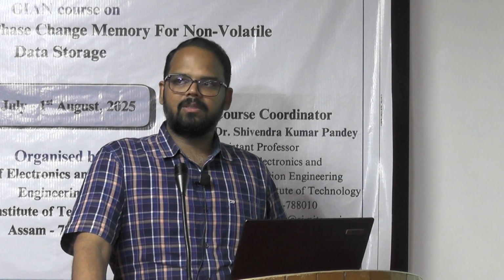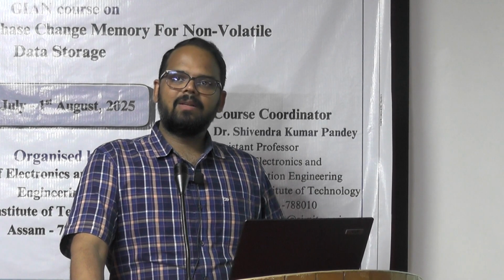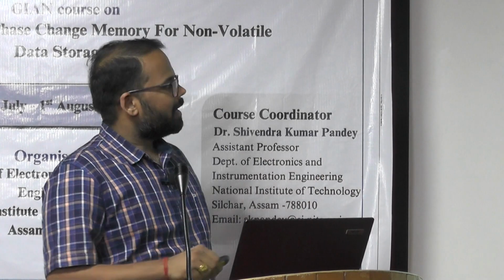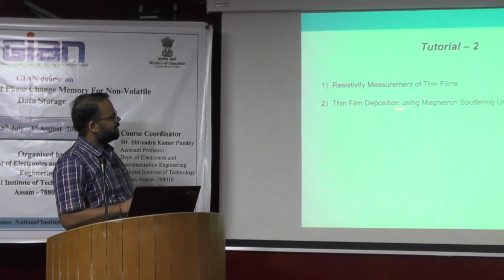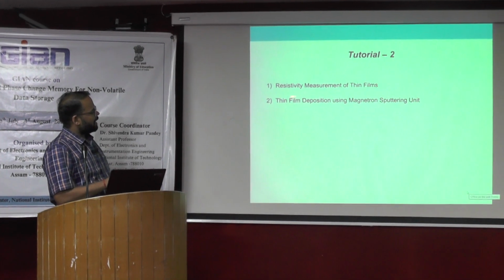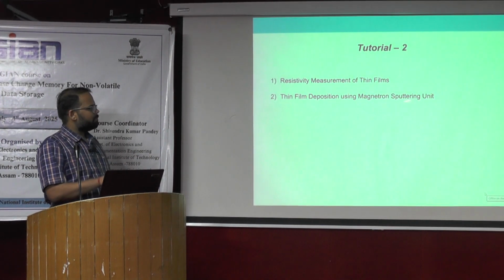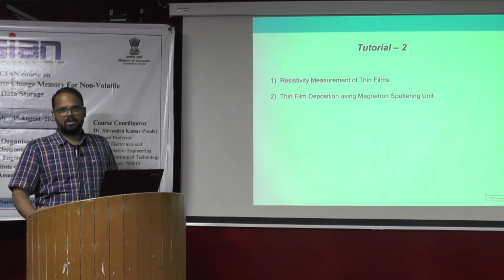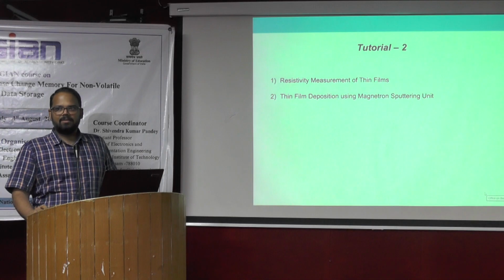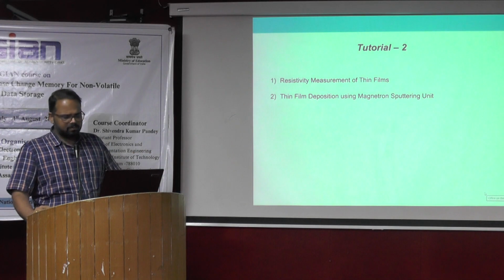On the basis of these things, I will cover a few aspects. The first part will be the resistivity measurement of thin films, and then thin film deposition. This I will discuss here, first part, and the second portion will be demonstrated in the laboratory. So we can identify in which way we can cover these aspects.